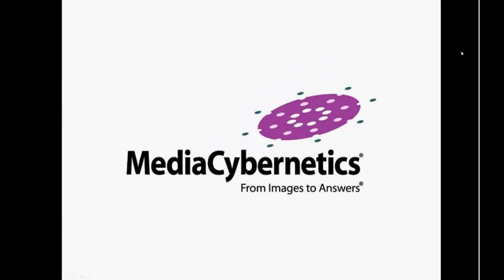Media Cybernetics has been at the forefront of innovation for over 30 years. And today we bring you the latest iteration of our flagship product, Image Pro. You may have heard of this product in the past by many names such as Image Pro Plus, Analyzer, Express, or Insight. And today we talk to you about our latest Image Pro Premiere software, which is the upgrade version for all of these products.